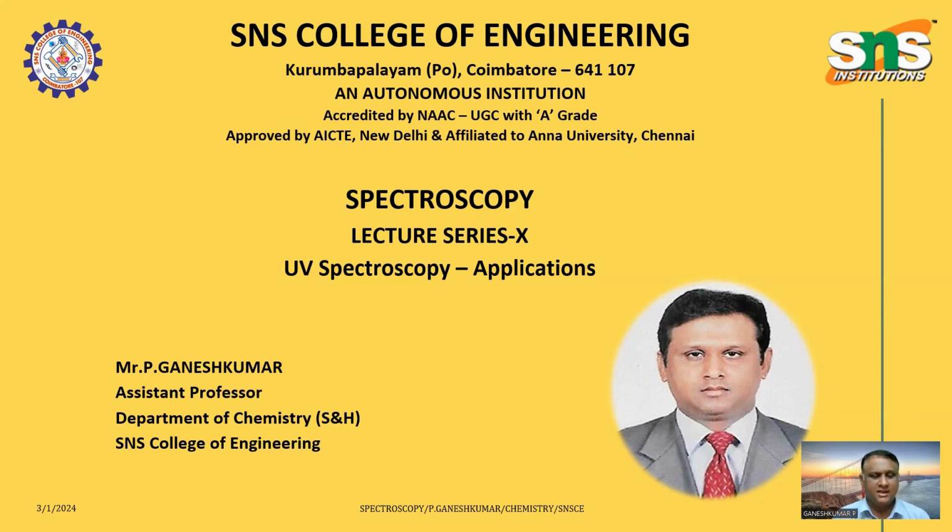So in this last part of the series on ultraviolet spectroscopy, we are going to discuss the applications of ultraviolet spectroscopy.